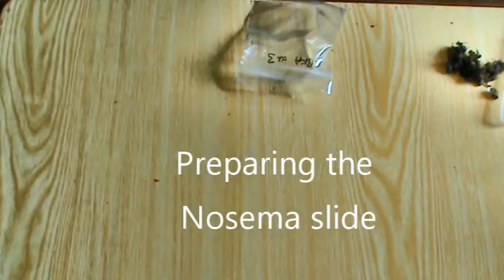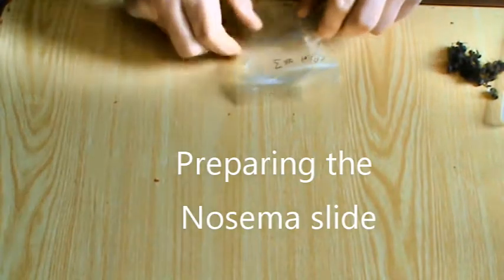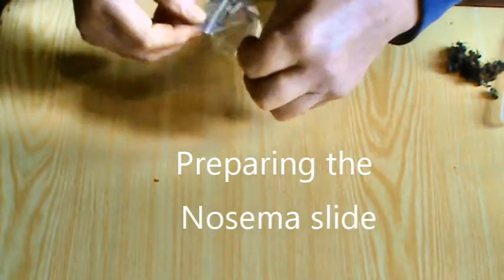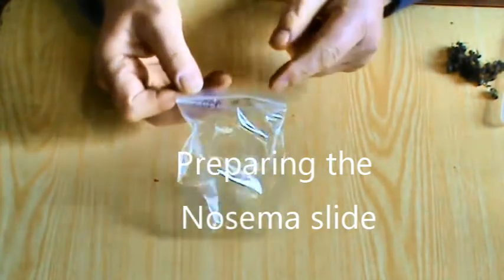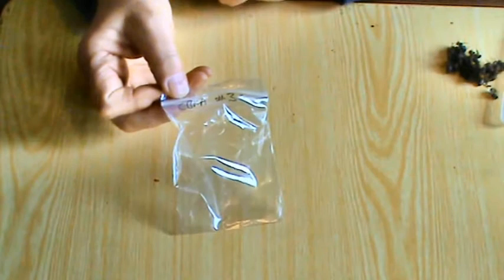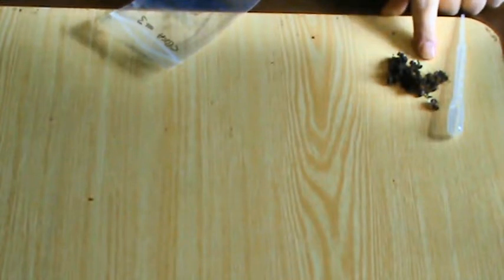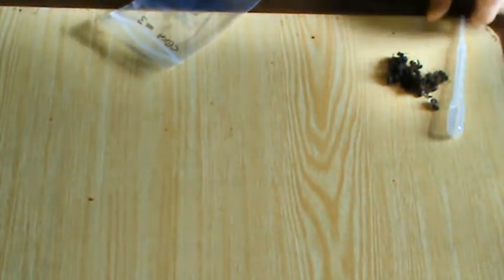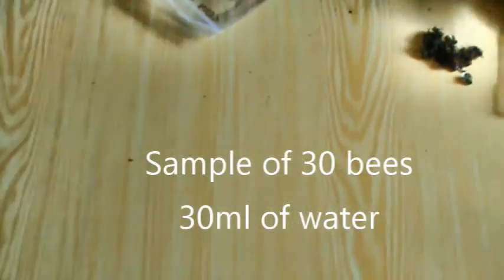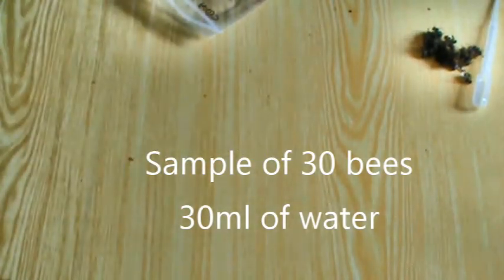So preparing the Nosema slide. We have the resealable bag here and we've written on there the identity of the hive. We have a sample of bees just down here, 30 bees, a pipette, and we've got a tub with 30 milliliters of water in it.